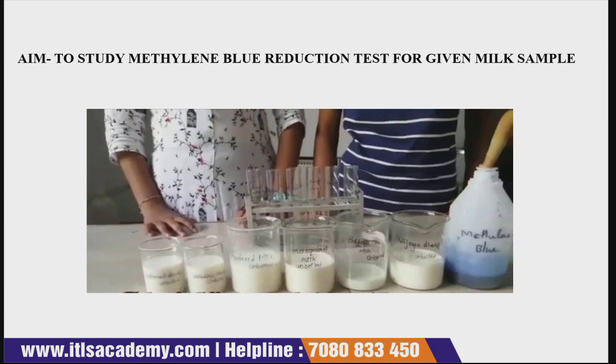Because of the oxygen consumed by these active microorganisms, the oxidation reduction potential of the milk gets decreased. Some common microorganisms that contaminate milk are Bacillus species, Pseudomonas species, and Staphylococcus aureus.